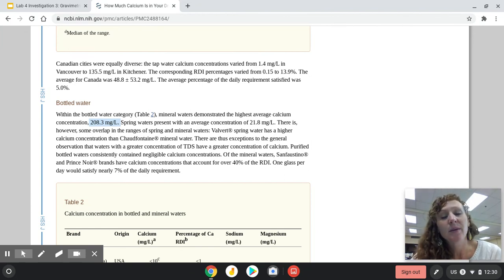Also, you need a hazards and safety data table that compares calcium. Well, I guess the calcium's in tap water, so let's assume that's safe. So the only thing you need to look up is sodium carbonate.